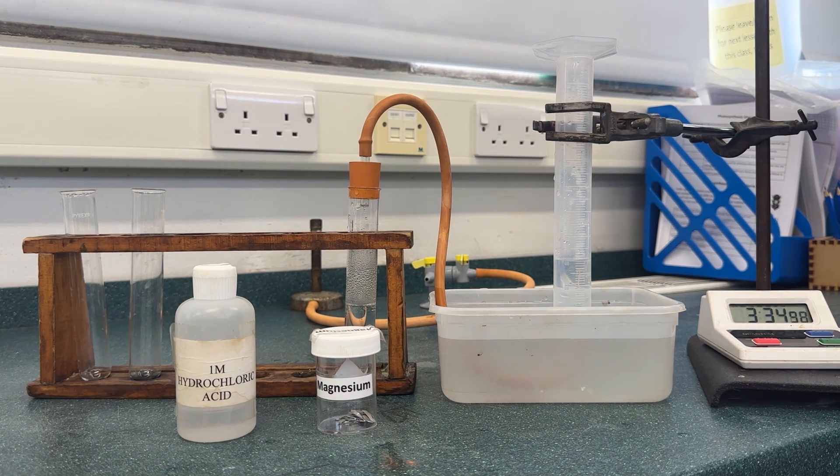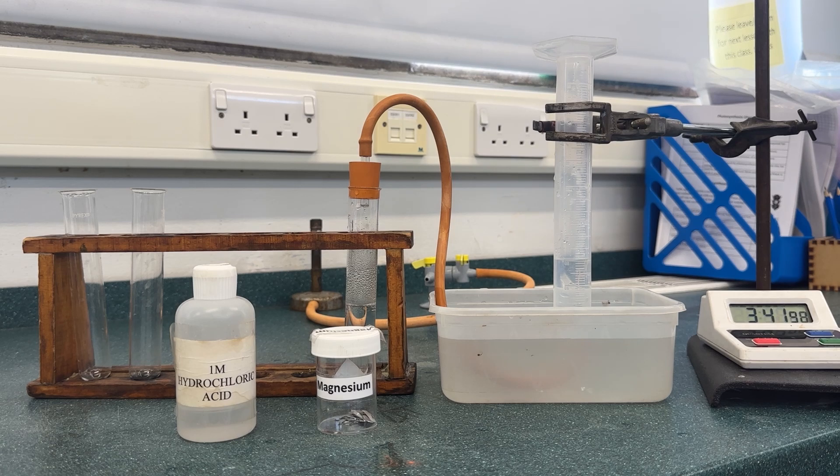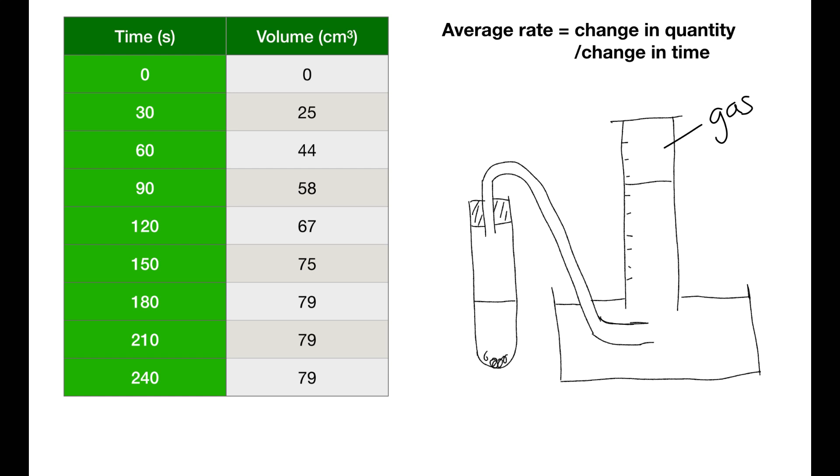The reaction is complete when no more gas is produced during your time interval. Here is an example of what your results would look like after a few minutes.